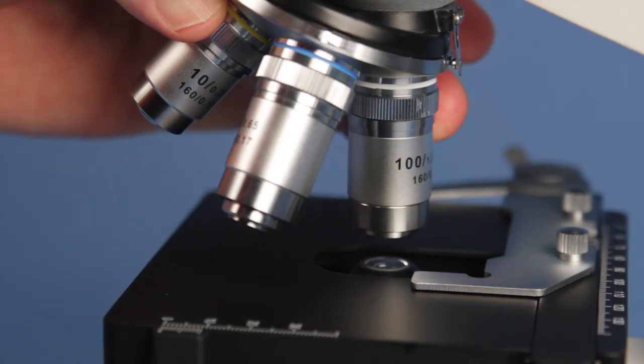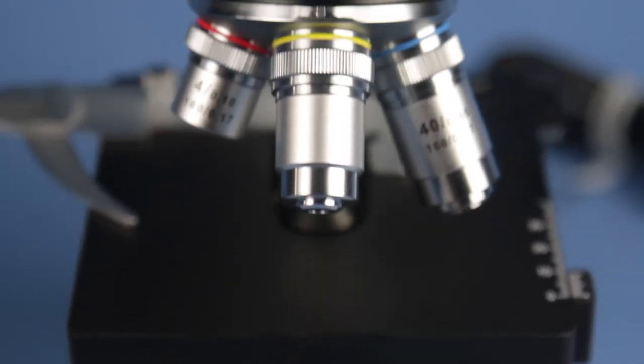With the added fourth objective, you can increase magnification to 1,000 times.